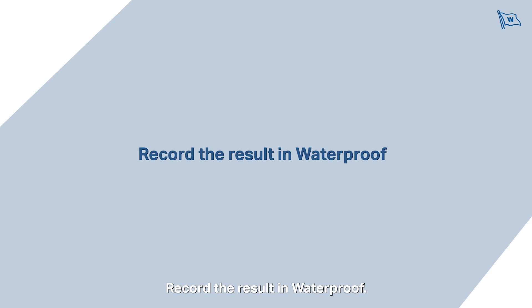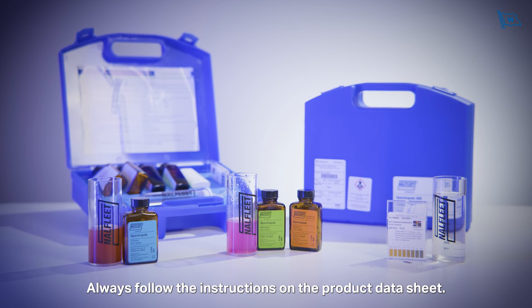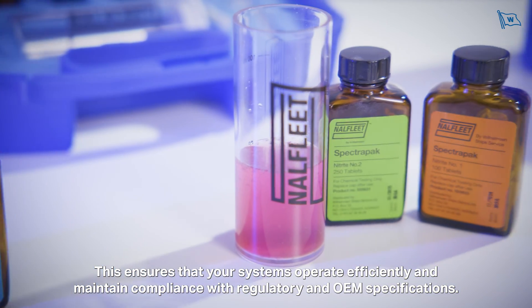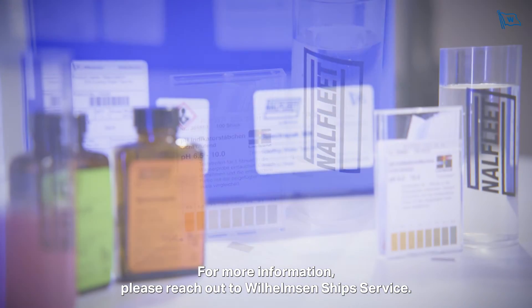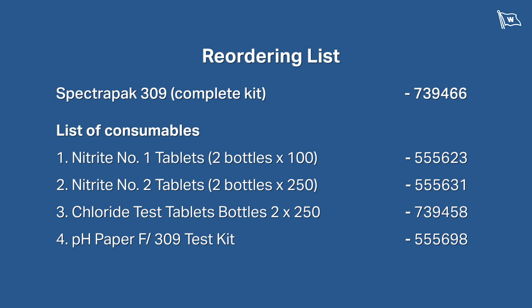Record the result in waterproof. Always follow the instructions on the product data sheet. This ensures that your systems operate efficiently and maintain compliance with regulatory and OEM specifications. For more information, please reach out to Wilhelmsen Ships Service.